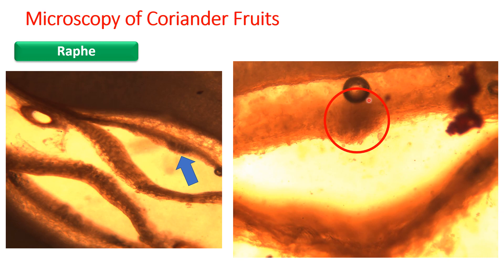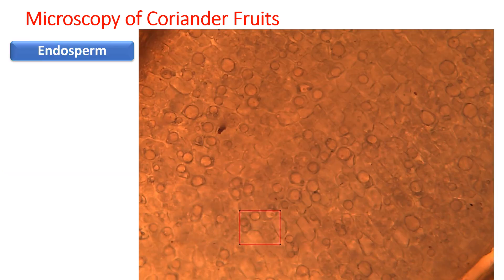The raphae, as discussed earlier, is the centermost vascular bundle. You can see a single zoomed image of the raphae with lignified cells in it. Lastly, the innermost region of the seed is the endosperm, which is rich in oil globules. On staining with Sudan Red 3 it gives a pinkish or reddish tint to the oil globules. Aleurone grains are also present here, which can be stained with picric acid, similarly to nux vomica seeds. This concludes the morphology and microscopy of coriander fruits.